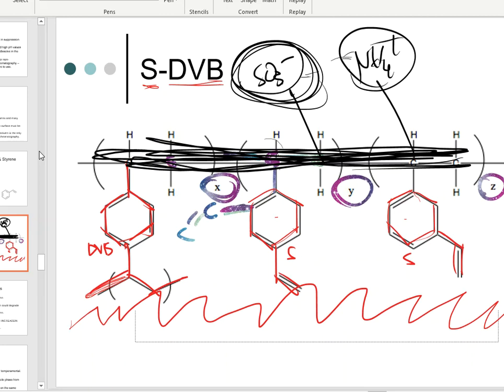And that is why these particles become slightly hydrophilic, because of those charged surface areas that are on the outside of that spherical particle on the inside of your column. And that is what does the separation for you, folks. It's as pretty and easy as that. I hope it's easy at least.